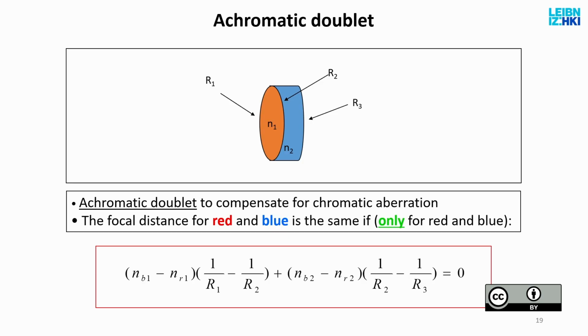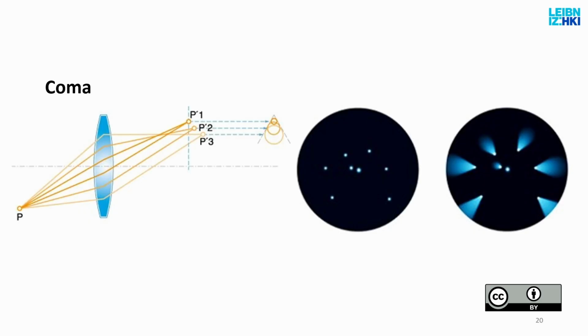You use test samples, which are small objects with multiple colors guaranteed to overlap, to test your microscope for such errors, such aberration. And a couple more which are much less often observed, but I'd like to mention them.